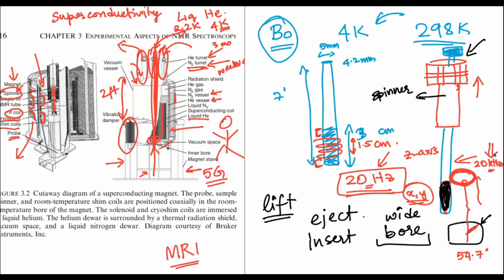But for the solid state NMR, you spin at a very high speed, which is why solid state NMR is almost always called MAS, magic angle spinning, solid state NMR spectroscopy. And generally they are attributed with the spinning speed. In this case, I get 20 kilohertz. There are nowadays rotors that can go up to 100 kilohertz.